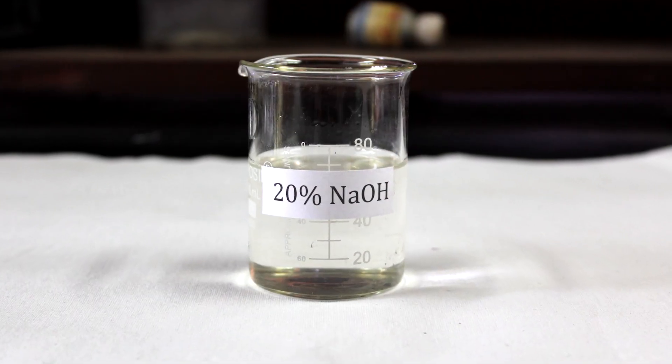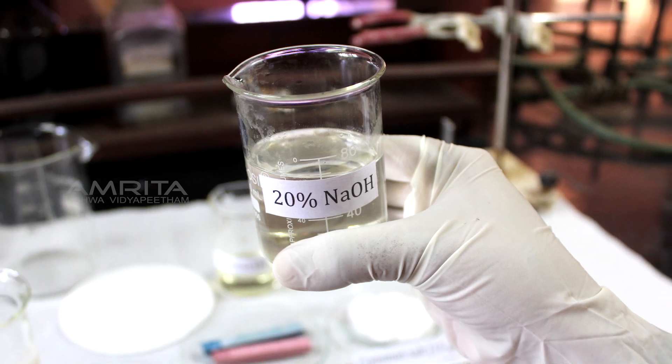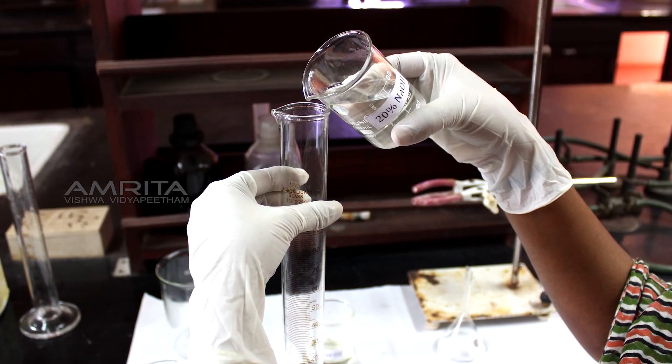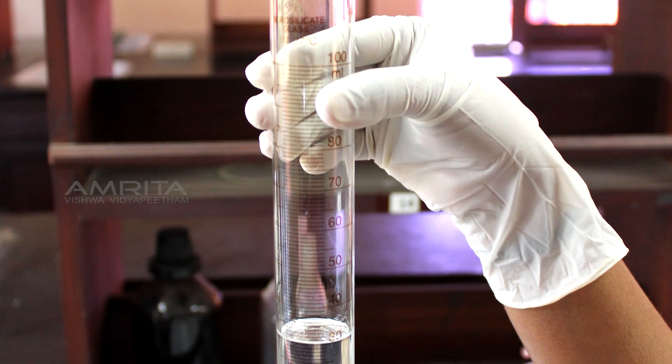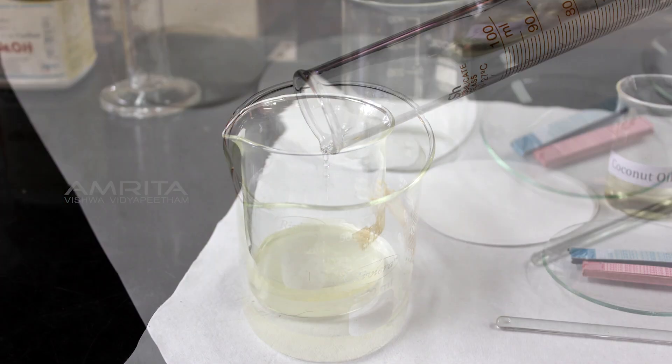Now take the beaker containing 20% sodium hydroxide solution. Pour 30 ml 20% sodium hydroxide into another measuring cylinder. Transfer it into the beaker containing coconut oil.